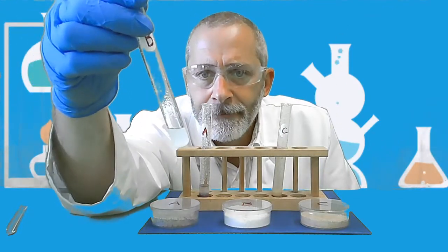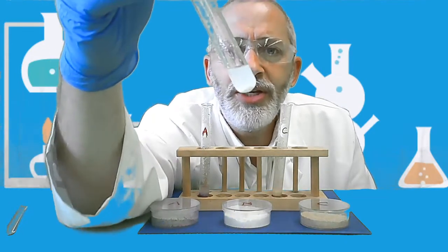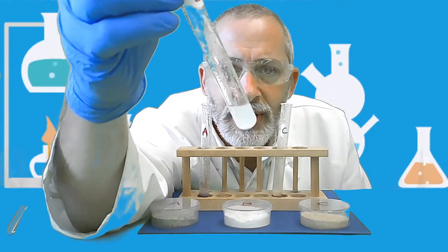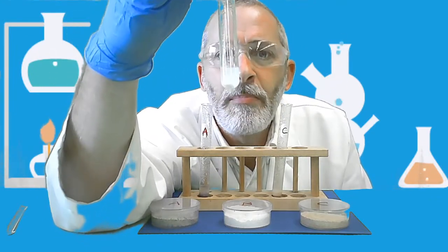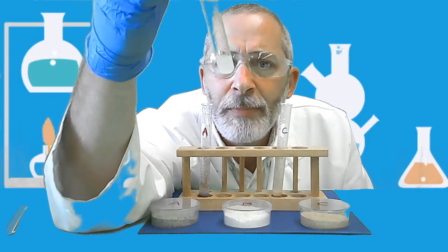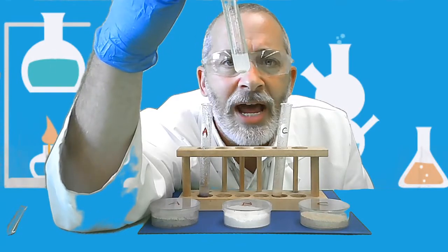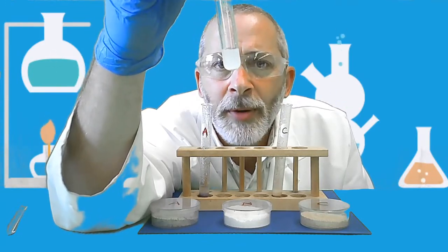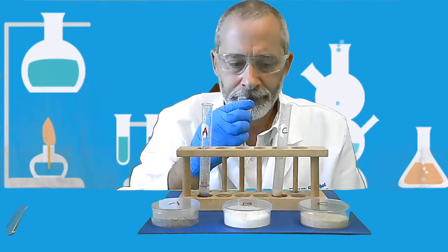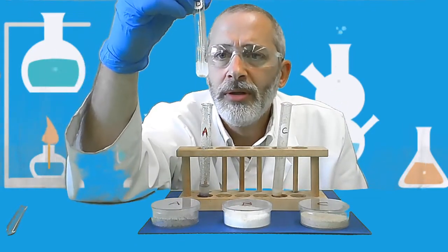Test tube B. There is a lot of settling on the bottom, but initially you can see how cloudy the water is. That's because there were a lot of bubbles that were released very quickly after I put the water in and shook it. There were a number of bubbles that came up, but now the bubbles have stopped. No more bubbles. So bubbles initially, but no more bubbles. And really no odor. No odor detectable by me.